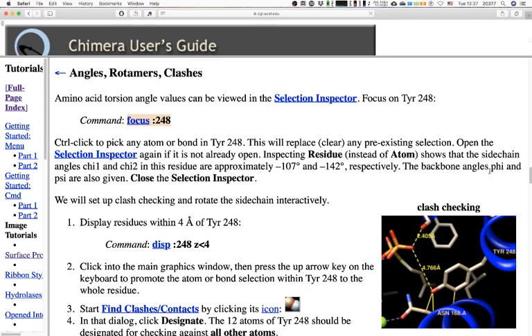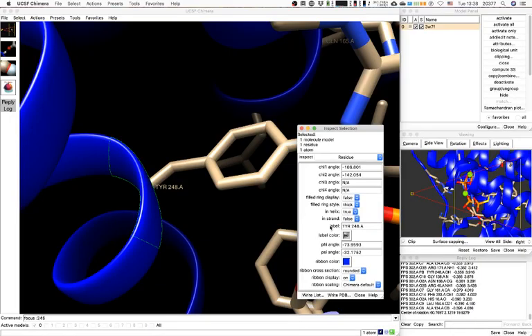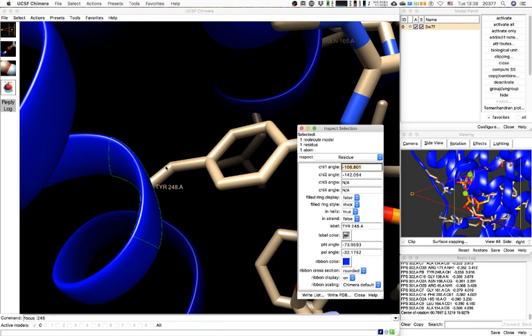The backbone angles phi and psi are also given, which describe the alpha helix orientation and the orientation of the side chain relative to the different carbon atoms. I haven't used this before and it's super useful — I'm going to start teaching this.